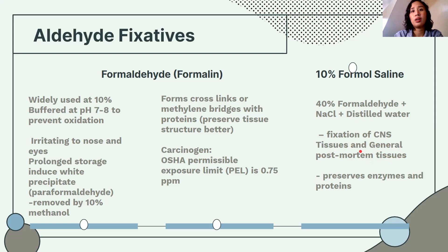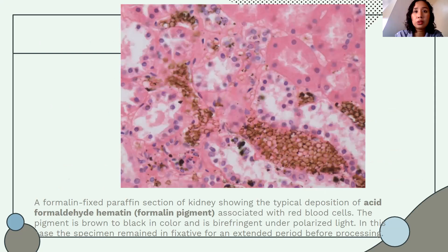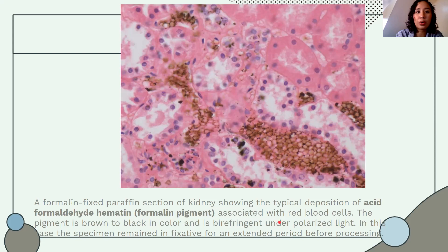This is a formalin-fixed paraffin section of kidney showing typical deposition of acid formaldehyde hematin — also called formalin pigment — which is a brown to black deposit under polarized light. This artifact forms when formaldehyde comes in contact with hemoglobin.